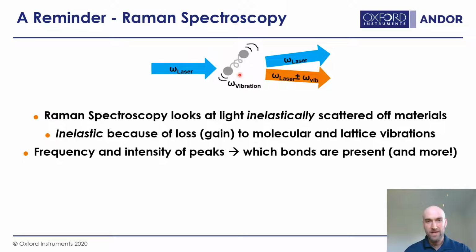That's what I mean again by elastic scattering: same rubber ball, elastic ball bouncing right back up to where you dropped it. And then inelastic, this is dropping the clay ball and it hits the ground, loses a bunch of energy or a bunch of momentum. Its frequency and intensity of peaks show which bonds are present and much more. And we're going to get into the much more part during this presentation.